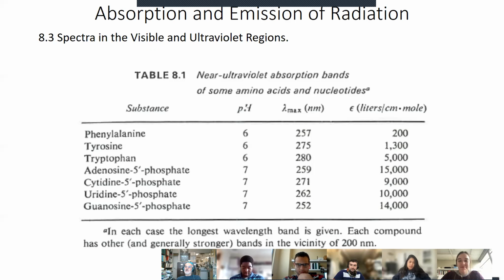All right. And then it shows you what the extinction coefficients are, how much light is absorbed. Okay. And so it gives you some property of how strong the I0 over I is, how big a change in the absorbance is per unit concentration. So notice the tryptophan signal is much bigger than the tyrosine, which is much bigger than the phenylalanine. So we will primarily use tryptophan and tyrosine for concentration. Notice all of the bases have comparable, not exactly identical, comparable extinction coefficients, but we'll have a little bit more to say about that in a moment. Okay.